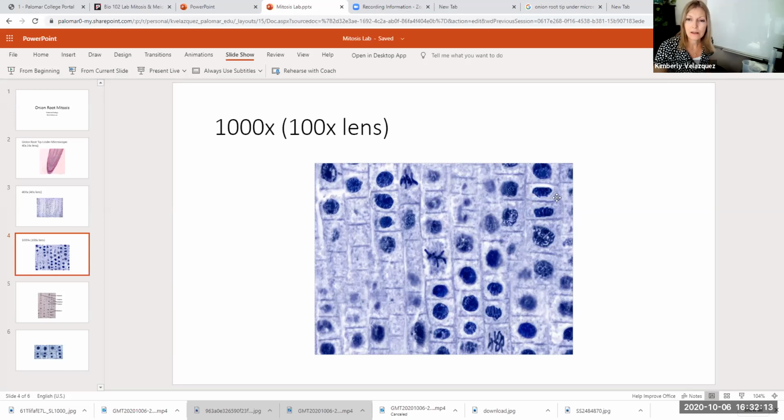Telophase is when we are dividing the cell into two new cells. And so the cell plate is how the plant cell is dividing the cytoplasm, starting to lay down new cell wall material between these two cells. And you can see new nuclear envelopes are starting to form. So we're getting two new nuclei and the cytoplasm is dividing. Cytokinesis is occurring by way of what we call a cell plate, since this is a plant cell.